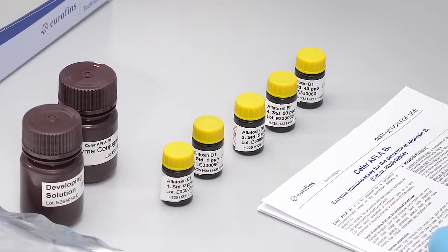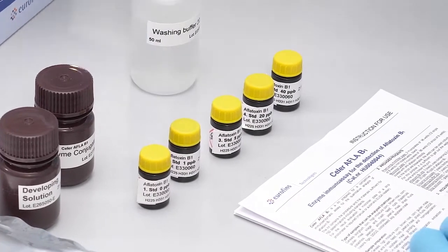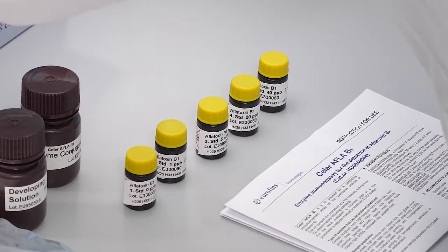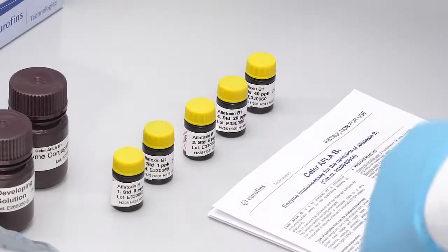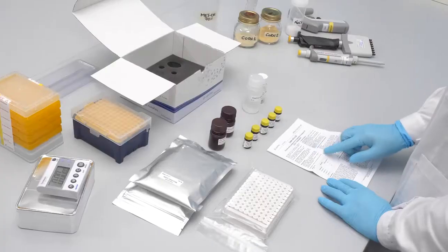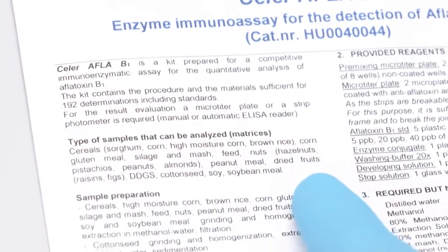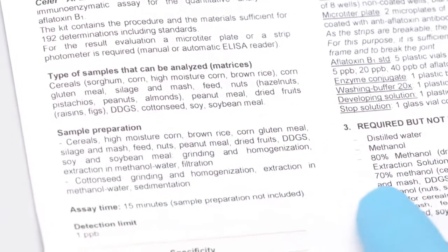The curve range goes from 1 to 40 ppb and can be extended to 200 ppb by sample dilution. The kit uses an antibody with high specificity for Aflatoxin B1. The kit belongs to the Cellar line of ELISA test kits for mycotoxins.